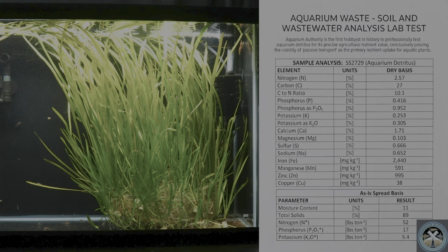The carbon being 27% and nitrogen 2.57% are really the stars of this whole deal. The C to N ratio of 10 to 1 is the golden ratio for soil health. It means that material will break down easily and release nutrients quickly without locking up in the soil. And this test again just proves that your aquarium waste is like a high quality fertilizer.